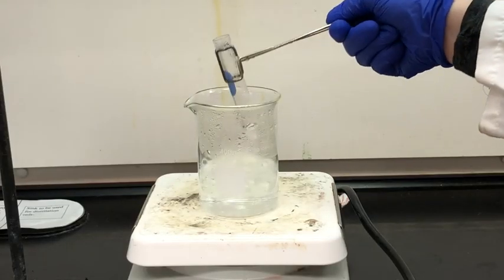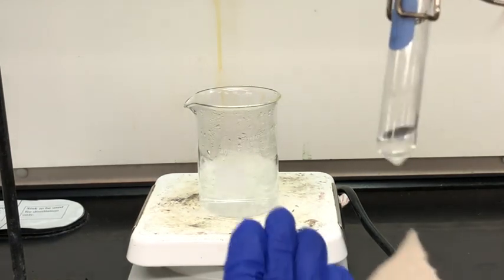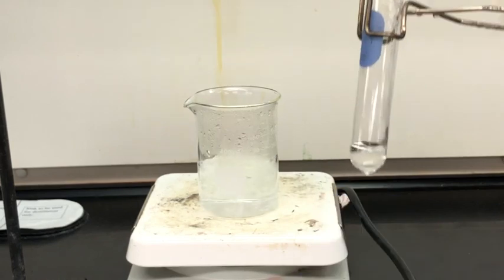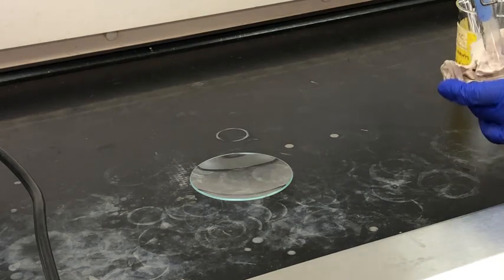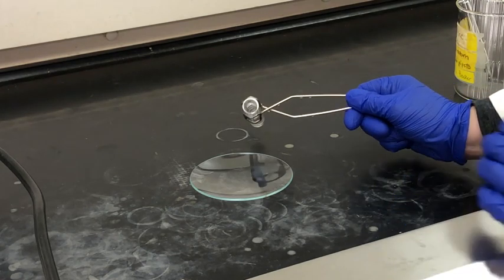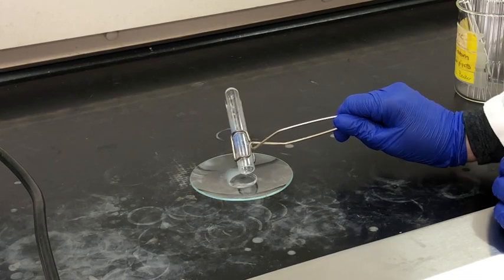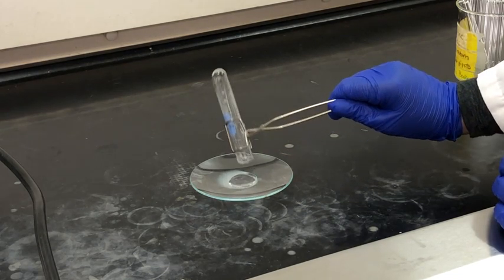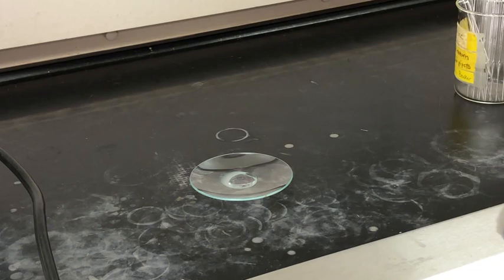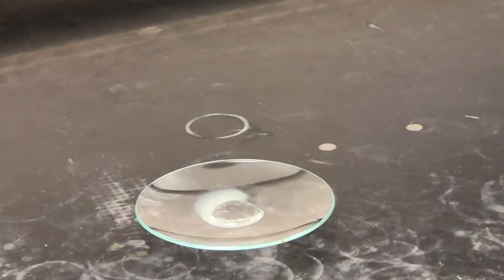Once our sample is done boiling we can remove it from the boiling water, and it looks like everything has dissolved, which is promising. Now we're going to pour our sample onto that watch glass that we just weighed, doing this very carefully so there's no splashing or spilling. You can see some steam around the edges and crystals already forming in the center.